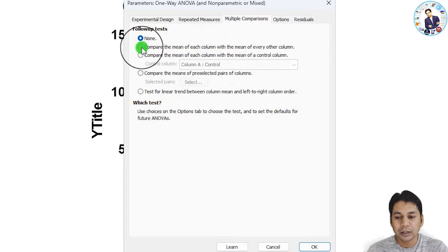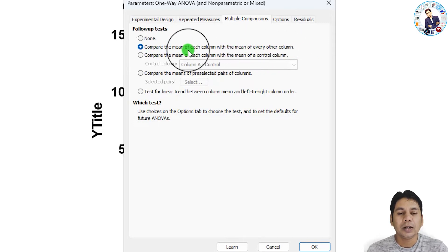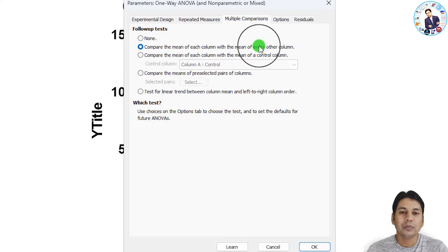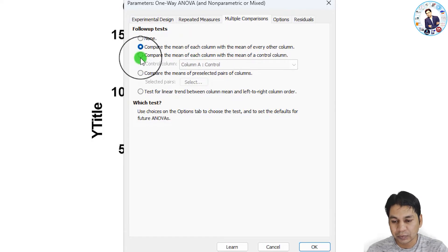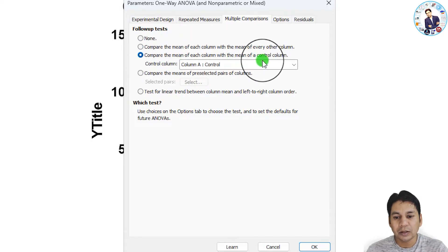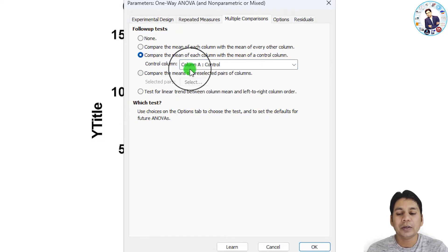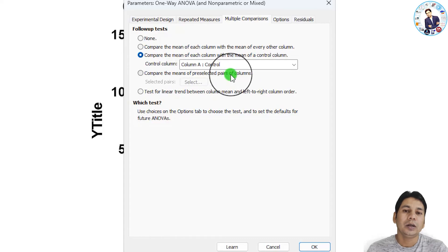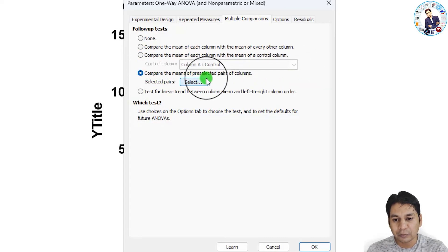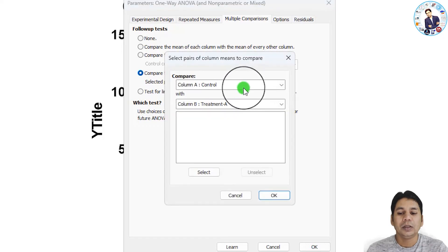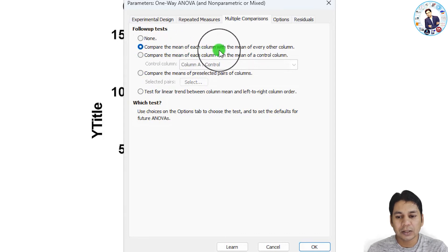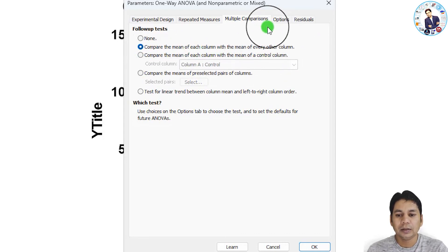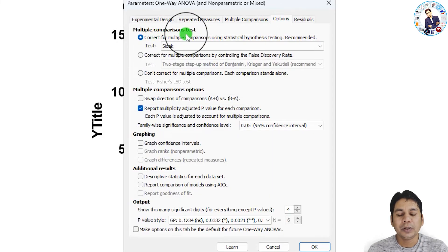By default, multiple comparisons is set to 'None'. You can select 'Compare the Mean of Each Column with the Mean of Every Other Column' to compare all group means against each other. Alternatively, 'Compare the Mean of Each Column with the Mean of a Control' compares other groups to the control group. There is also 'Compare the Mean of Pre-selected Pairs of Columns'. I am selecting 'Compare the Mean of Each Column with the Mean of Every Other Column'.